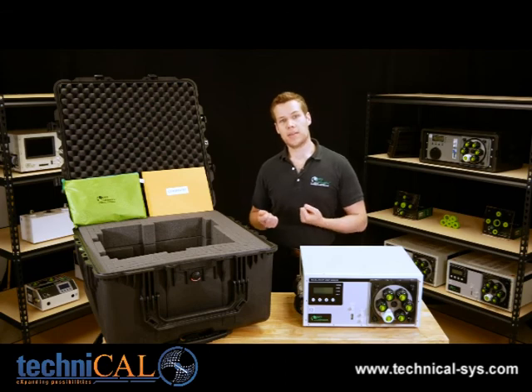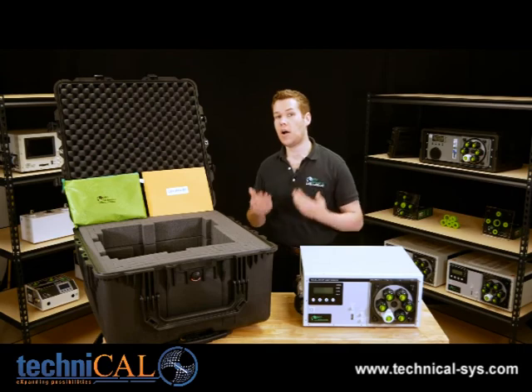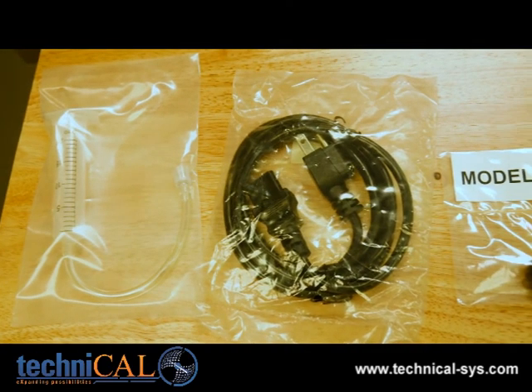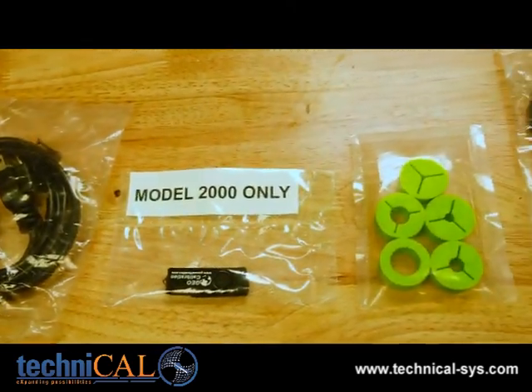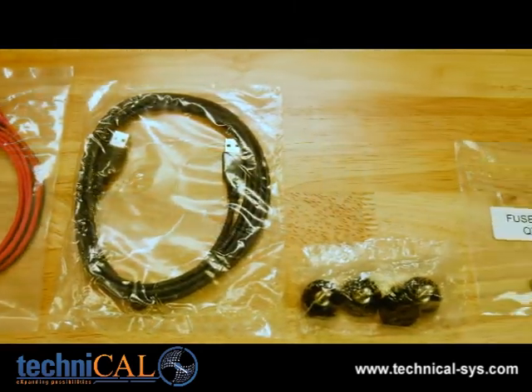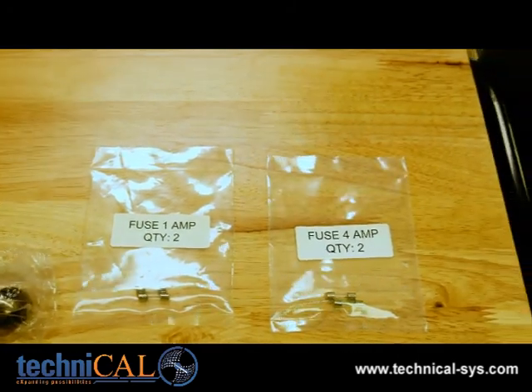Assuming the unit passes your initial inspection, you should check the green bag to make sure you have received all of the following items in your accessories kit: one fill tube, one power cord, one USB stick, one 5 bung set, one set of positive end ground leads, one USB A to A cable, four door screws, two 1 amp fuses, and two 4 amp fuses.